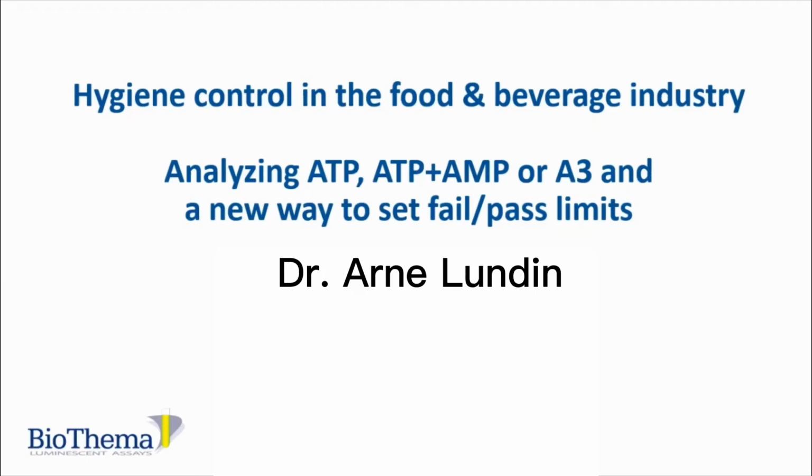Ladies and gentlemen, today's webinar is on hygiene control in the food and beverage industry, specifically on analyzing ATP, ATP+AMP or A3, and a new way to set fail-pass limits.